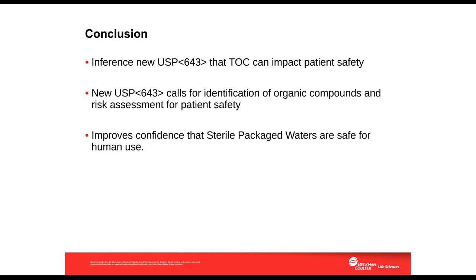It is also asking users to do further testing when certain levels of TOC are breached to identify each organic compound in the water to better understand the risk to patients. Now, this is a significant change, and it will hopefully bring improved confidence that sterile packaged water is safe for human use.